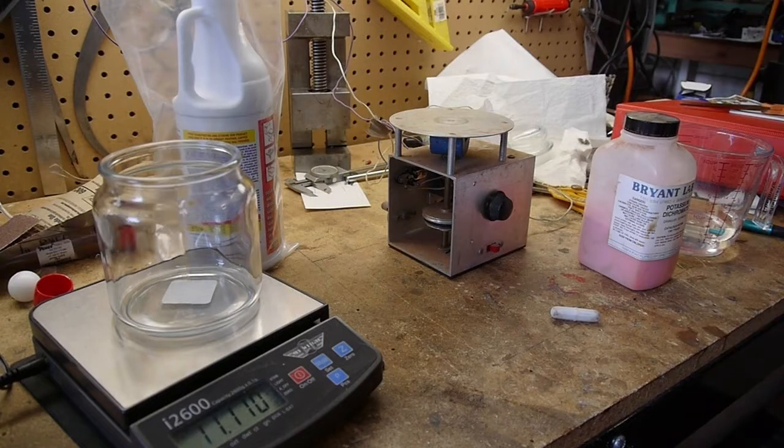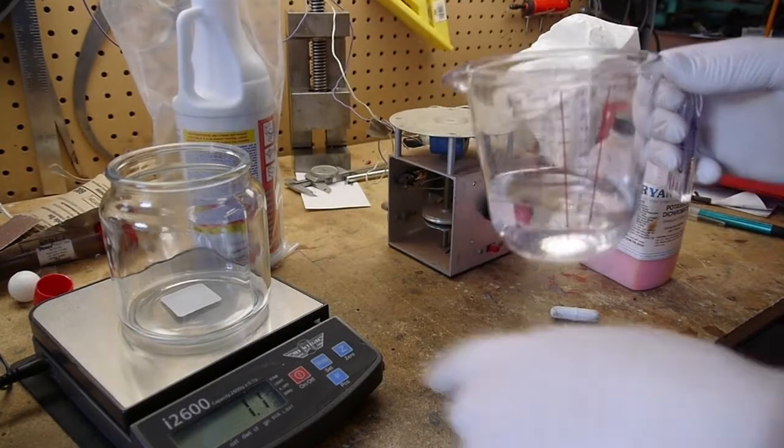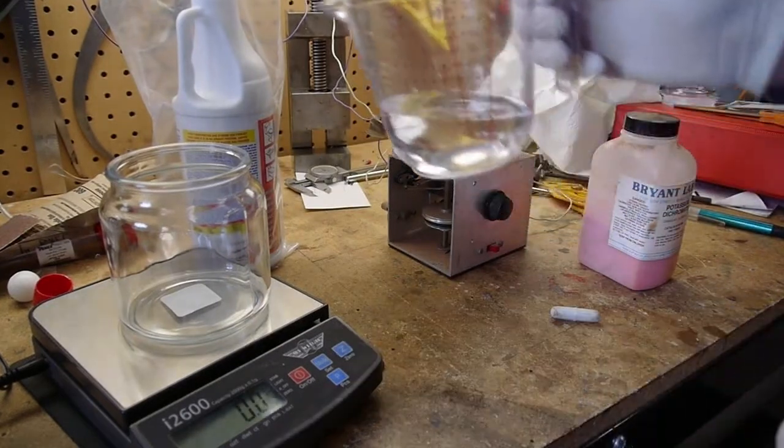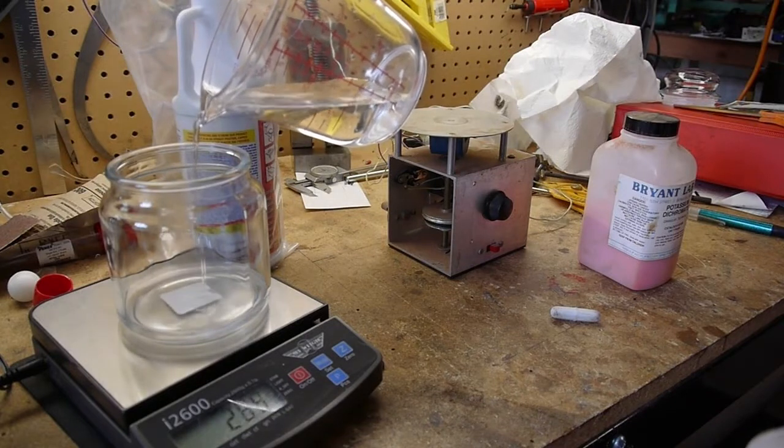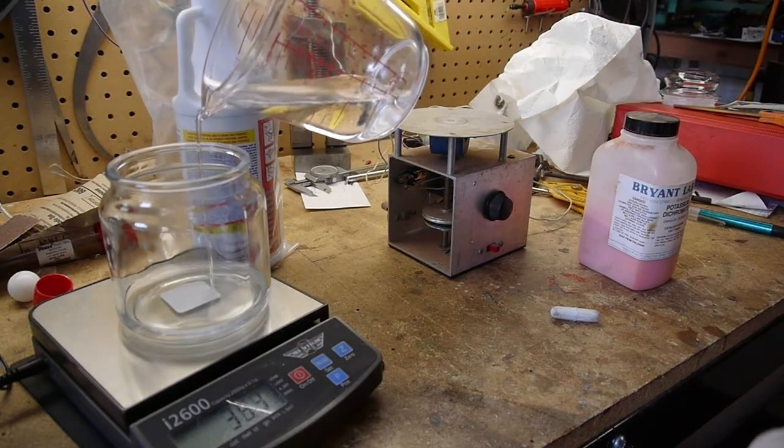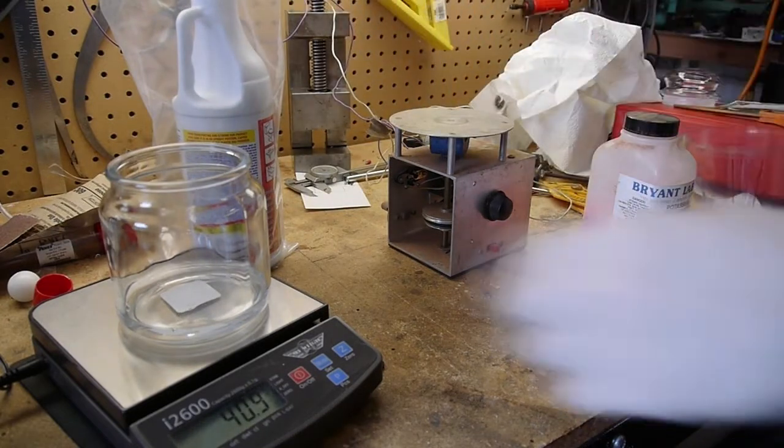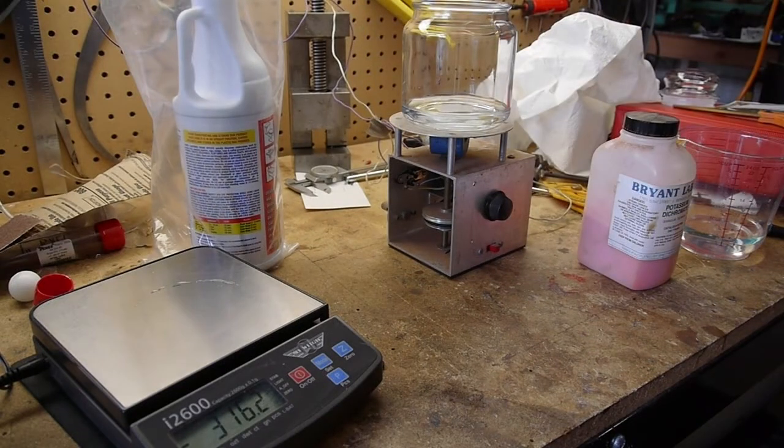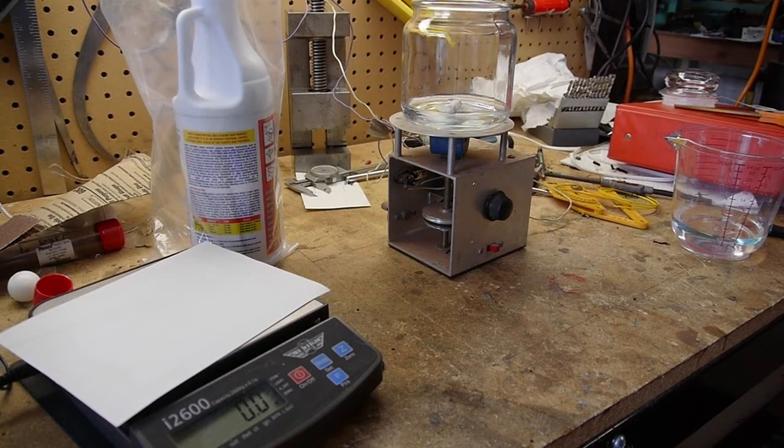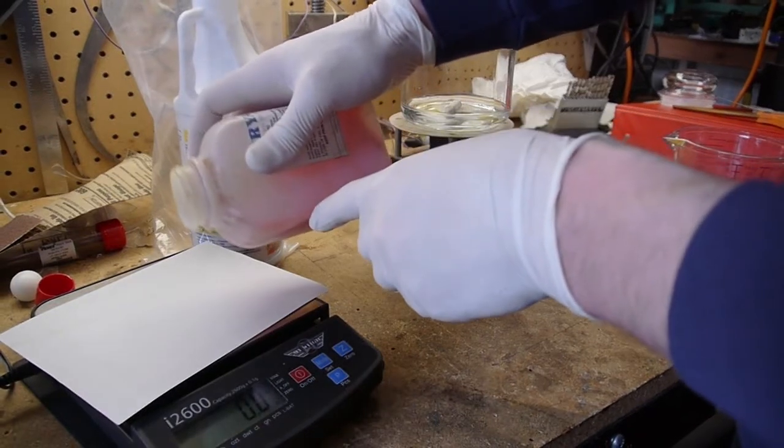Okay, so we're going to measure out 40 grams of water. Okay, 25 grams of potassium dichromate.